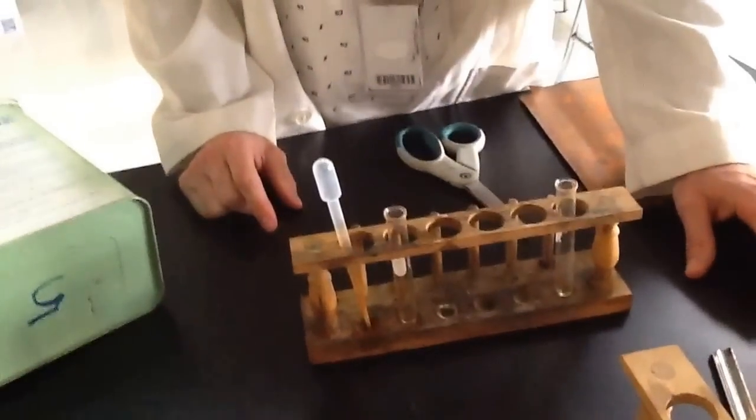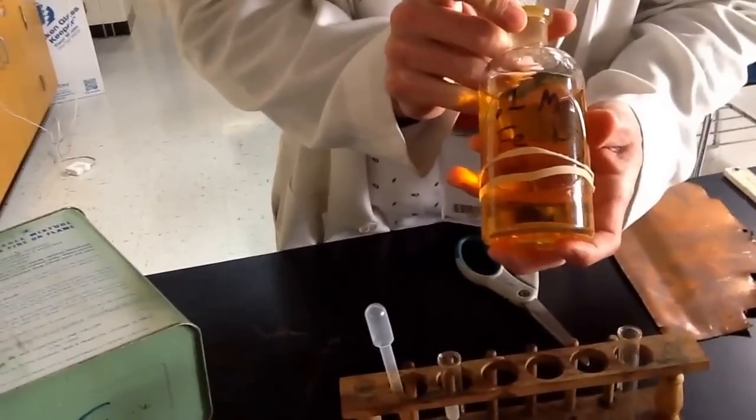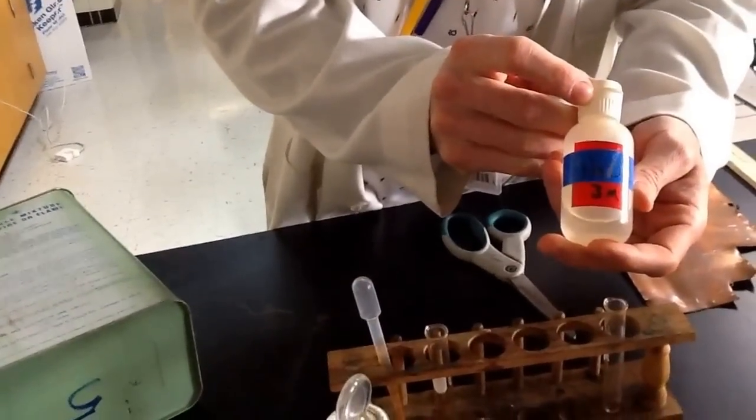Alright, hi everybody, I'm Mr. Scott. I'm going to show you a reaction called a double replacement reaction. So right here we have some chemicals. We have the iron nitrate, and then here I have some 3 molar sodium hydroxide.